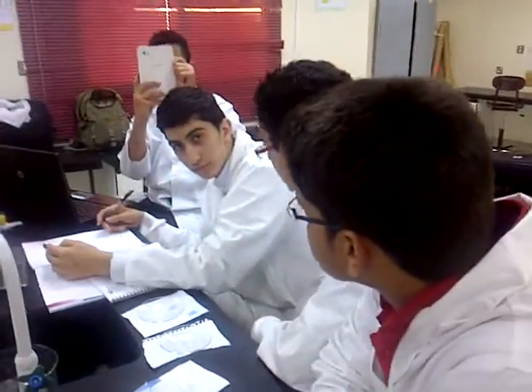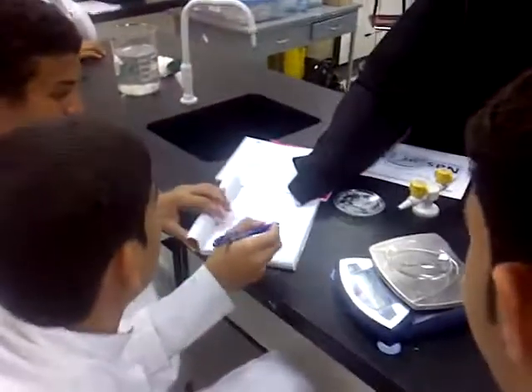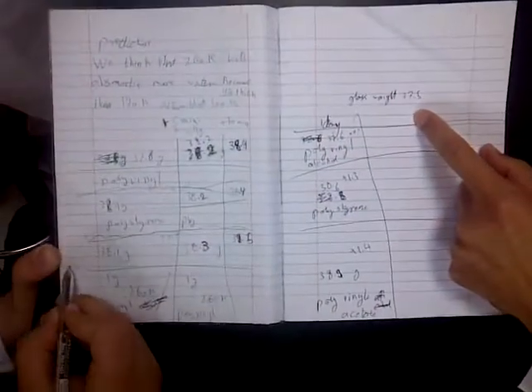Okay, they will get a watch glass. They have to weigh it. Yeah, right here. Just use that. Okay, how much? What is the weight of the polymer that you start out with? 37.4. What is the weight of the polymer? The glass is 37.5, and what did you get when we start after first start 3A?